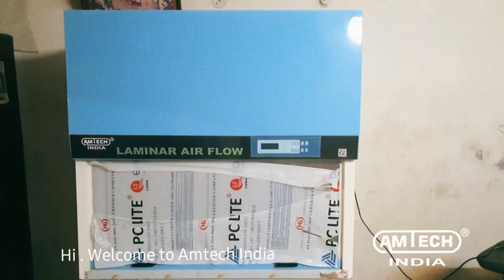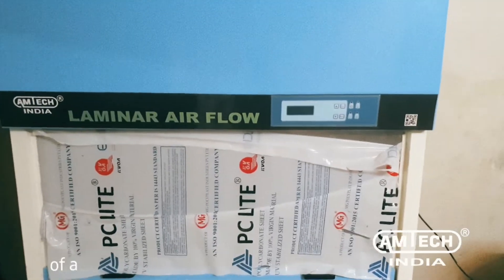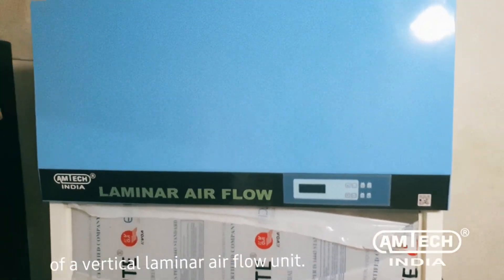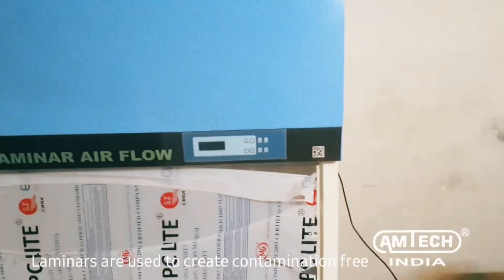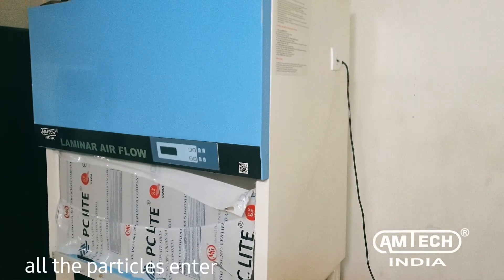Hi, welcome to Amtech India. This video illustrates the demo and working of a vertical laminar air flow unit. Laminars are used to create a contamination-free environment through filters to capture all the particles entering the cabinet.